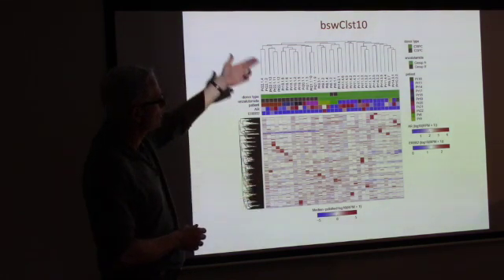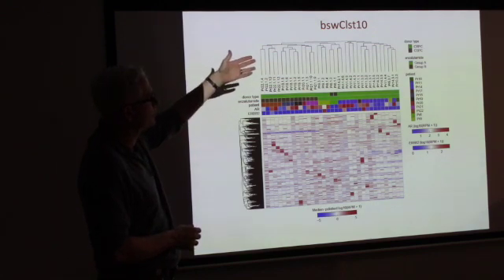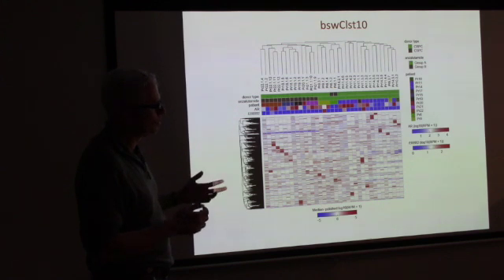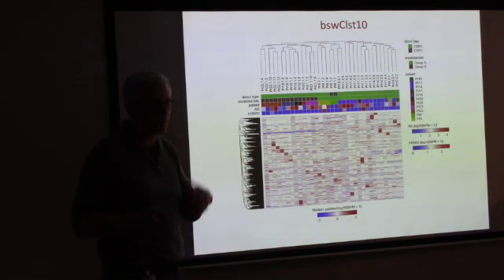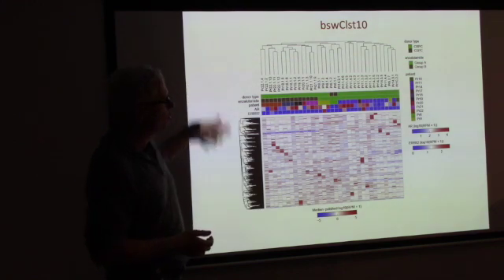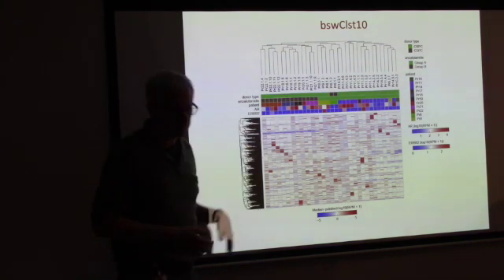So one package is called BSW-10, and Vishal will supply you with the actual software so that you can install it. But it produces these kind of plots.